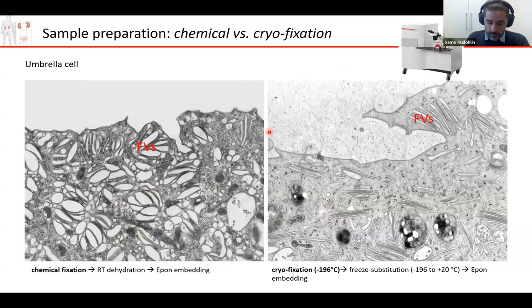And when we did the first round of imaging, we found that our samples were not prepared accordingly. We saw much charging, the contrast was low, the sectioning was not as we would like, the tissue was too soft. So we had to go back to the lab and start optimizing the protocols.